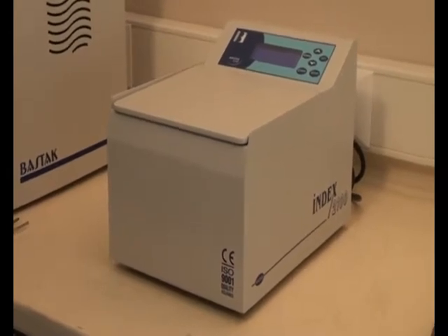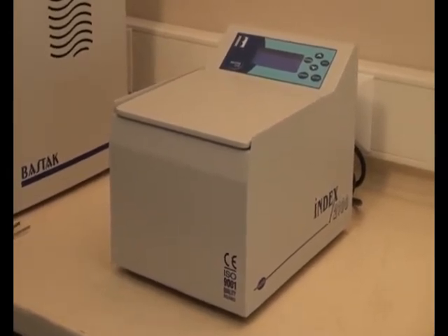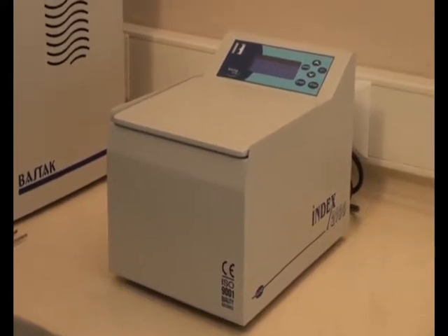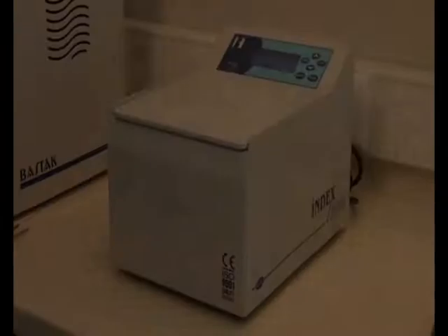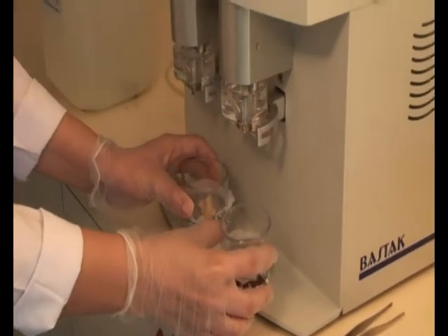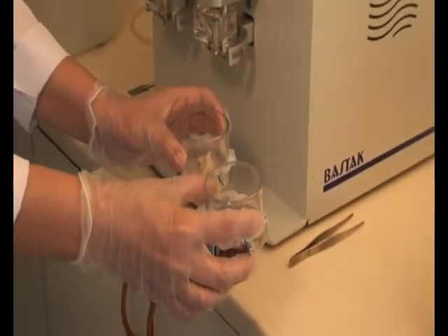The Bastak 2100 model gluten index machine is used to determine the quality of wet gluten. Wet gluten, which is obtained by the Bastak brand gluten washer, can be taken for an index test.